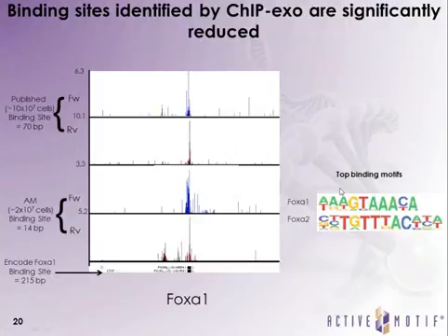And once again, these samples were run through the Homer program looking for which motifs were being bound, and we find that both FOXA1 and FOXA2 were the predominant binding sites being found, which is very nice, which you expect to see.